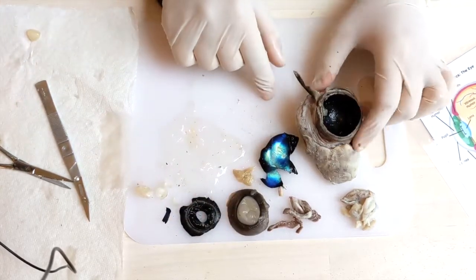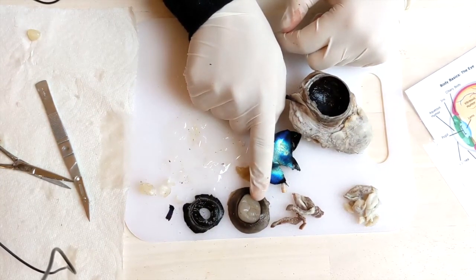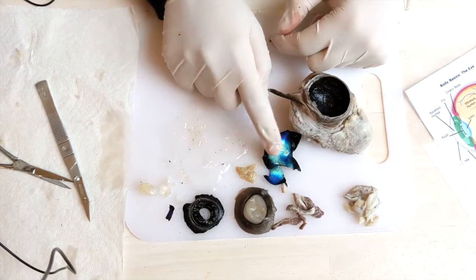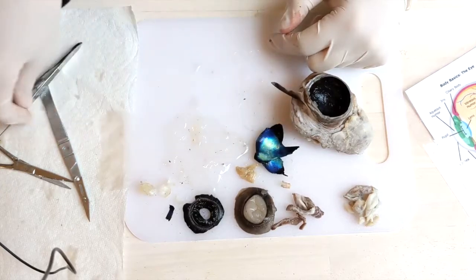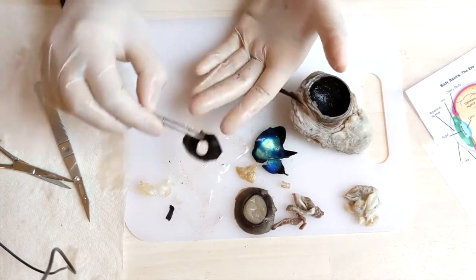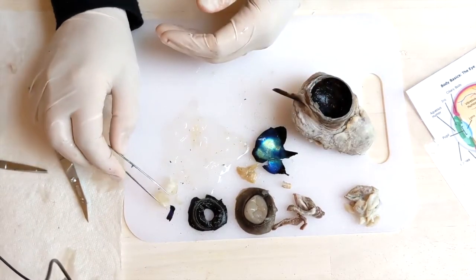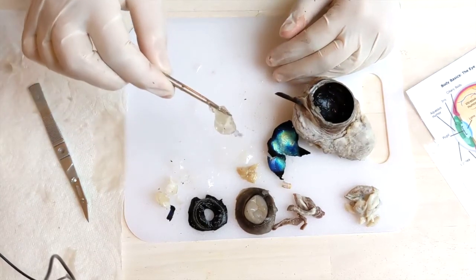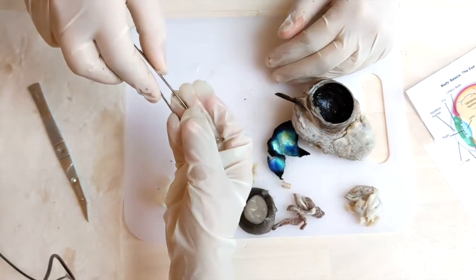Okay. Can you tell me what this is called? Lens. No, that's not the lens. What is this? Cornea. Yes, this is the cornea. Good job. All right, can you tell me what this is? Tapetum? Yes, good job. That's the tapetum. Can you tell me what this is? Lens. Iris. The iris. Oh, come on. Why do you like the lens so much? What is this? Lens. Now you got that one right. That's the lens. Okay, can you tell me what this is? Optic nerve or cornea? No, that's the vitreous humor. Humor. That's the vitreous humor. Has a funny name.